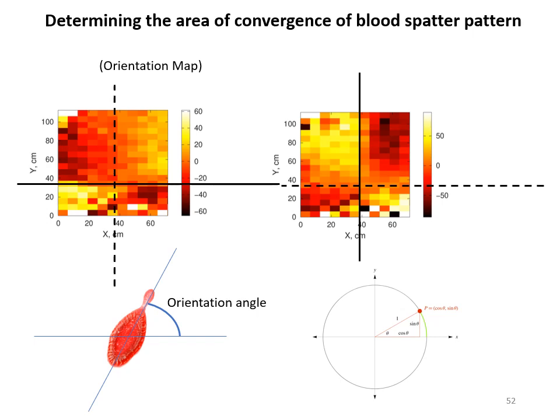You see, each time you have a contrast between a dark region and a light region. And what I have plotted, those lines here, are the known location of the impact location.